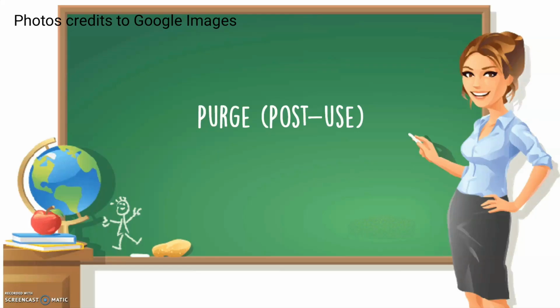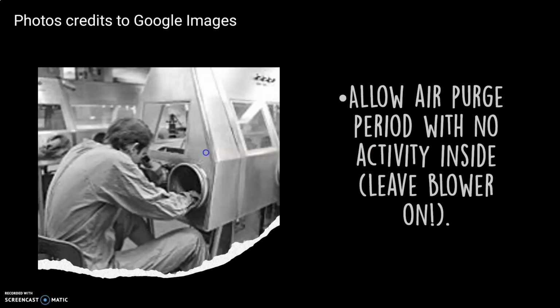And for the post-use, after you use the biosafety level cabinet, you have to allow an air purge period with no activity inside. So you have to leave the blower on. Actually, class, this biosafety level cabinet is used by experts or qualified scientists.